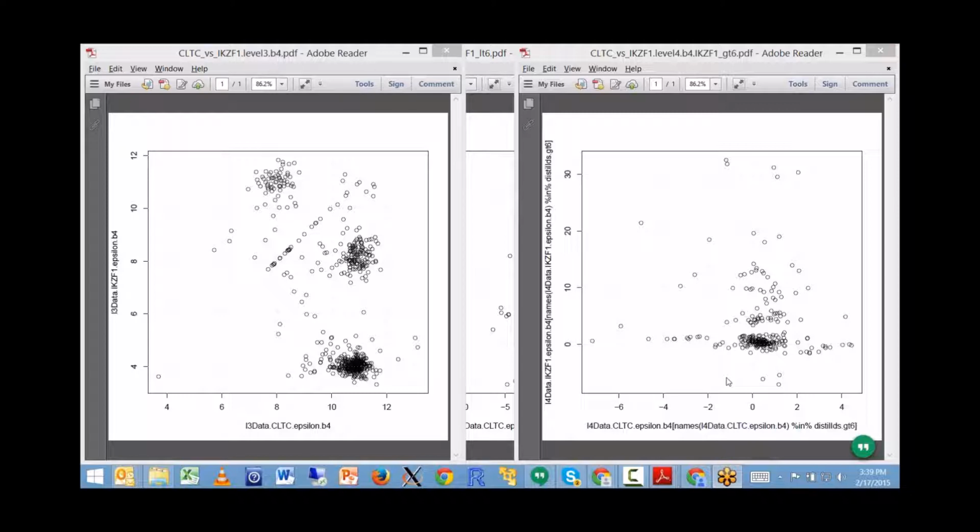This is Kai Young from the University of Washington. I'm wondering, does anybody in the audience know what GEO expression profiles the Broad has used to generate the interpolation, the regression coefficients? Because if we know what those GEO expression profiles are, we could probably use them as an external benchmark to gauge whether some genes are supposed to be, in general, lowly expressed, using Mario's hypothesis.